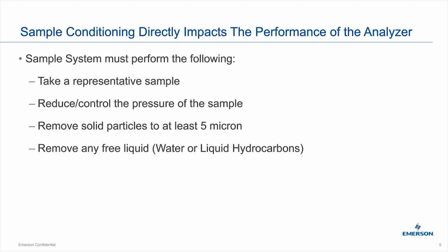If you're able to do the above four items, it makes maintaining the composition of the sample much easier, but you still do have to be careful about hydrocarbon dropout when you're changing the pressure, which can affect the temperature.